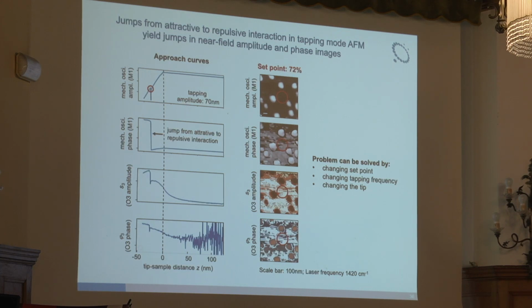Where this happens actually depends on many parameters, but typically, particularly with clean, sharp AFM tips, this happens. With the platinum tips that we use, this is a particularly nice example, and we worked hard to get it, let's say, textbook-like done. But in the end, it's a phenomenon that is studied a lot in AFM, and with very sharp pointed tips, it regularly occurs.